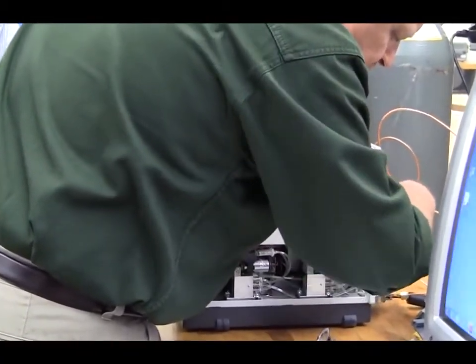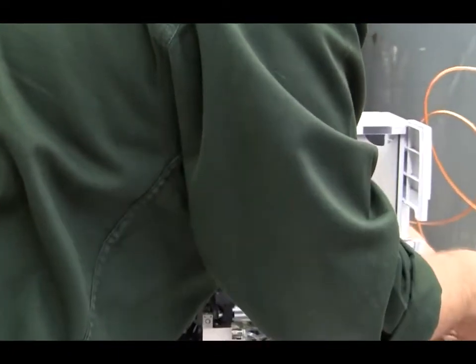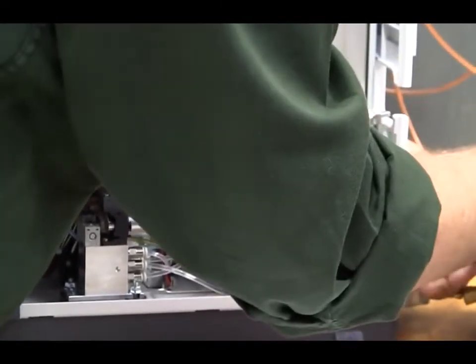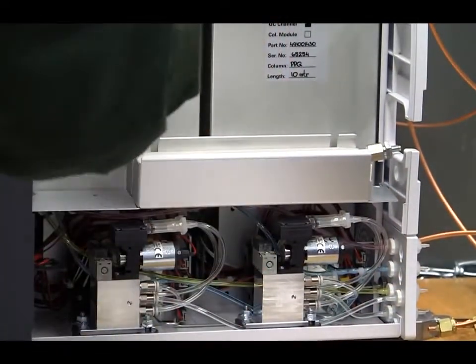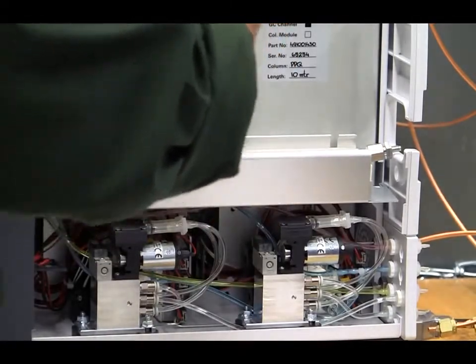While I'm taking it apart and talking about it, the carrier gas ought to be set at 80 psi, plus or minus like 5%. I think the spec says plus or minus 10. I'd say plus or minus 5. And the reason is that it's also used to drive the solenoids, and so they have to be within a certain range.